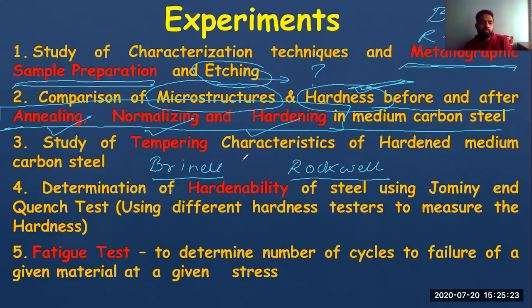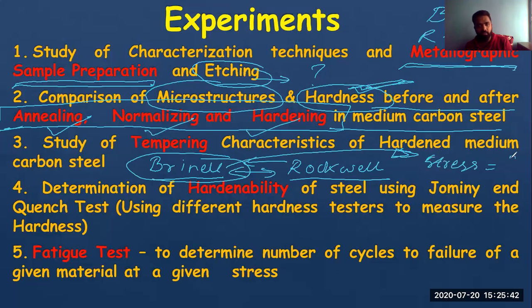What we basically use is the Brinell hardness number only. You can convert Brinell to Rockwell, or Rockwell to Brinell also. You can even convert this hardness value to a standard unit, in terms of stress value. That is also possible. But basically we try to find the hardness value in terms of Brinell, BHN, or Rockwell, RHN.